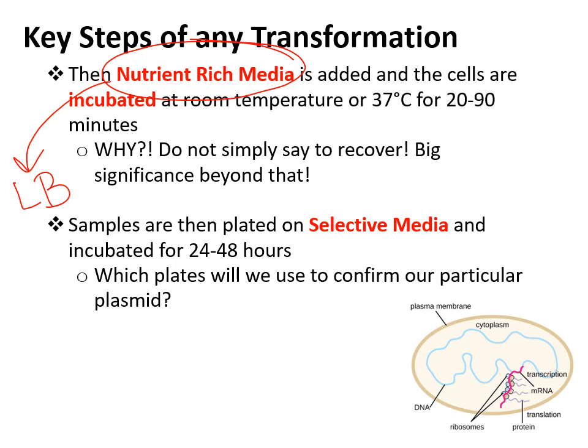Now, the reason why you incubate the cells at this point in nice nutrient-rich media is not simply a recovery phase. Think about it. The plasmid that you just put into those cells, what is the plasmid? It's DNA, right? Well, will that DNA as DNA protect that plasmid from the antibiotics you're going to use later in the final steps? No, the DNA cannot cut those antibiotics. What cuts them is the enzyme or the protein made from that DNA.